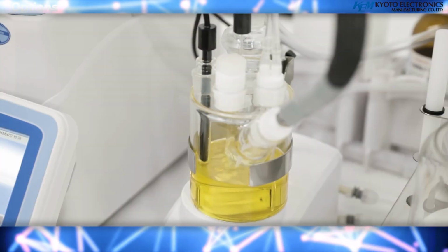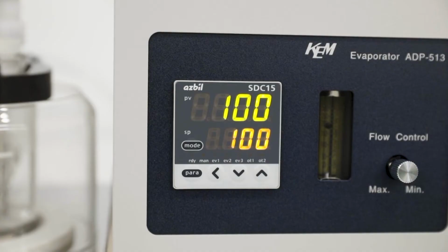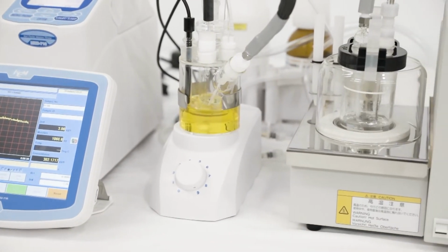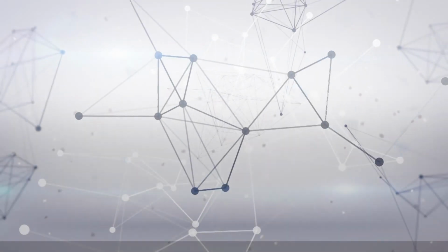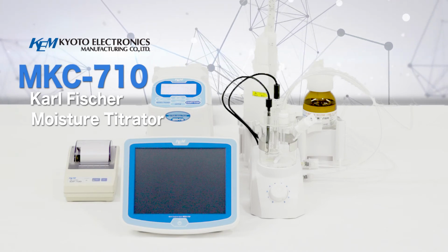When the measurement is complete, the measurement result will be displayed. This is the basic process for using the evaporator for oil sample, ADP 513. Karl Fischer Moisture Titrator, MKC 710.